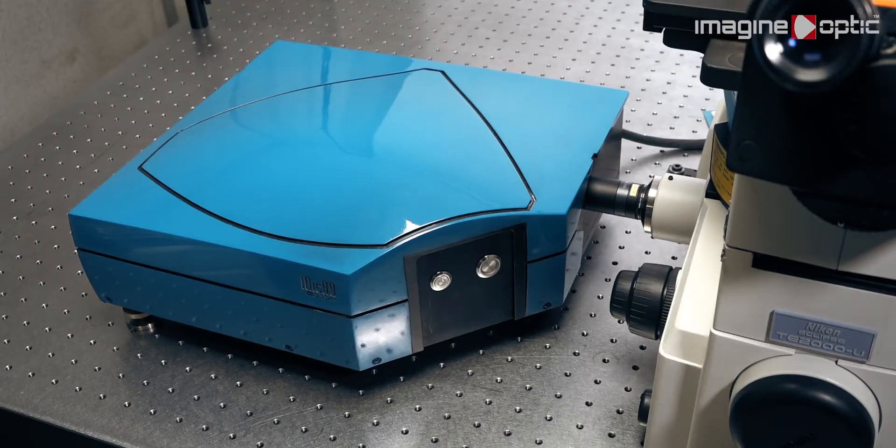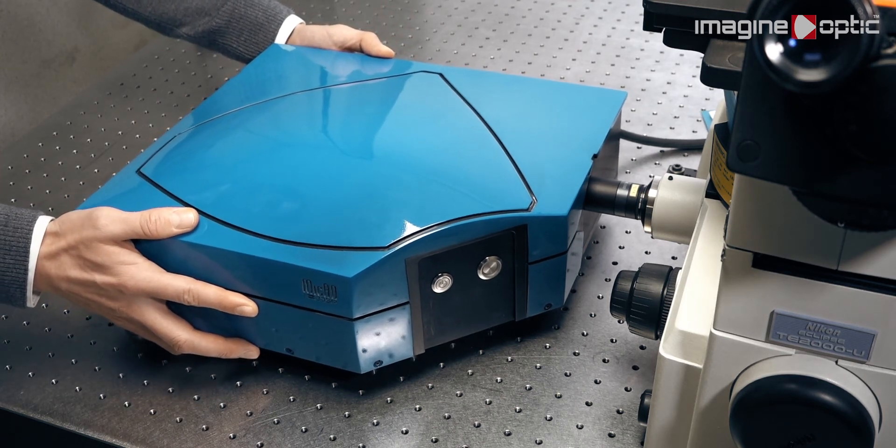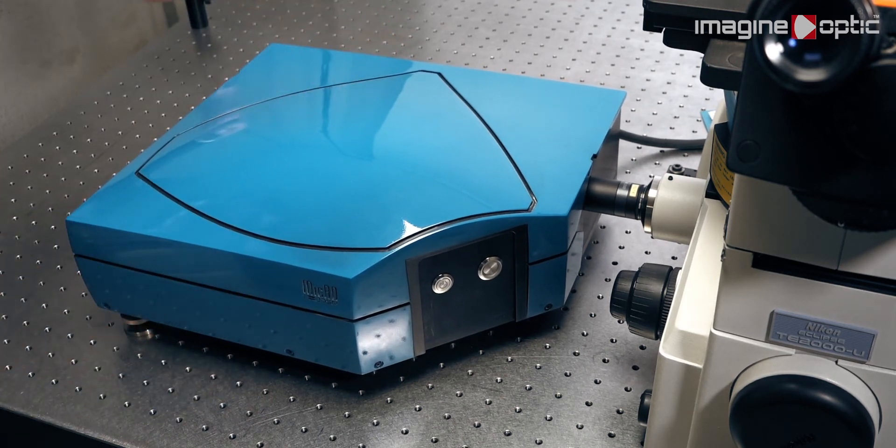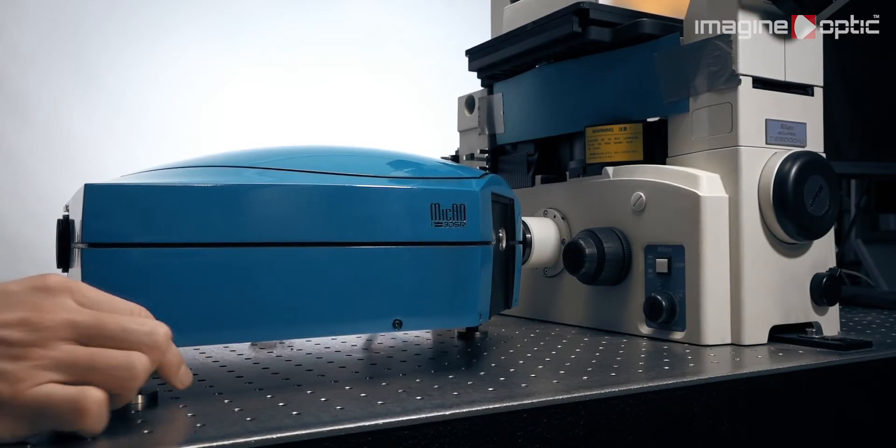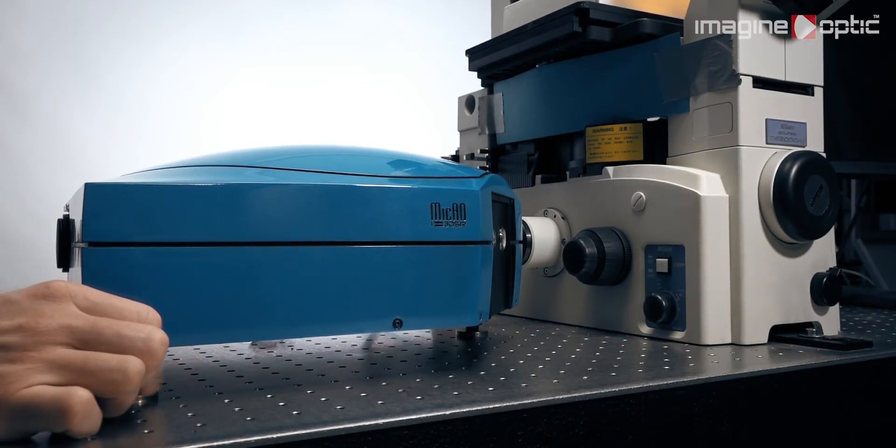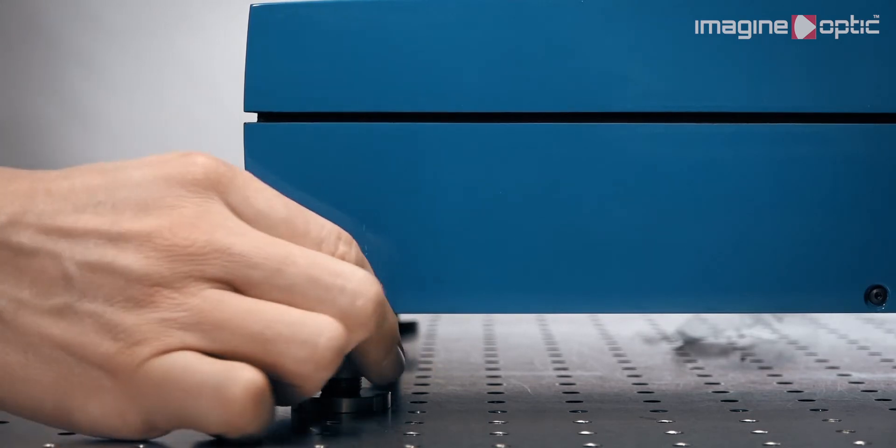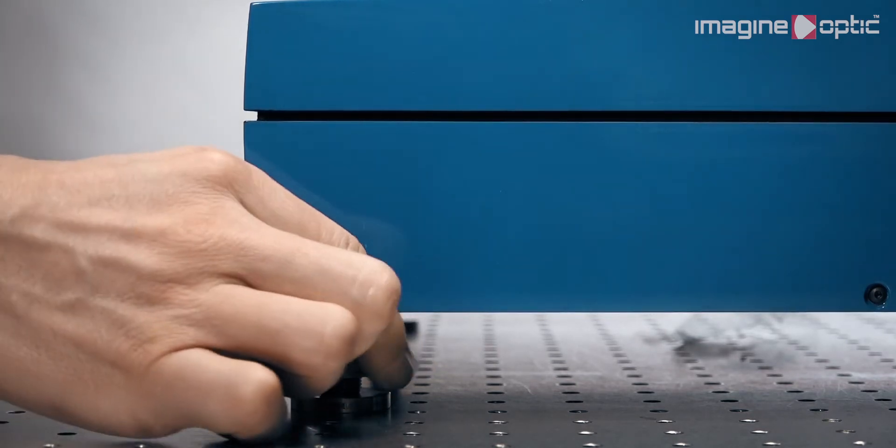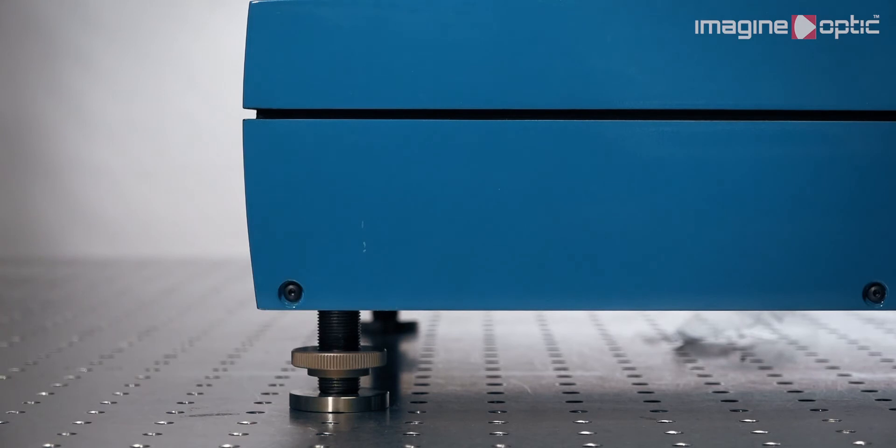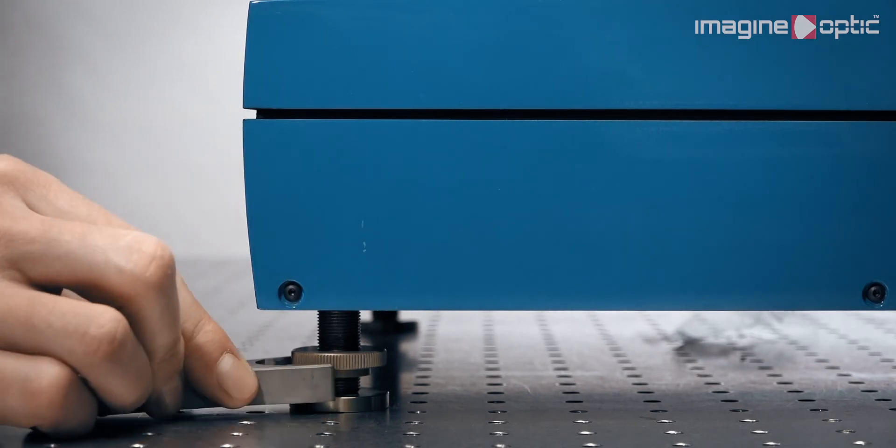The installation of Mikao unit is straightforward. The first step is to align it with the microscope. It is possible to adjust the height using the feet of the Mikao unit and adjust the horizontal tilt by playing with the lateral position of Mikao. Once the optimal position is found, Mikao's device is firmly fixed to the optical bench using clamps.